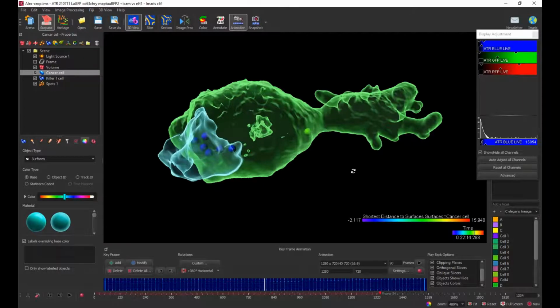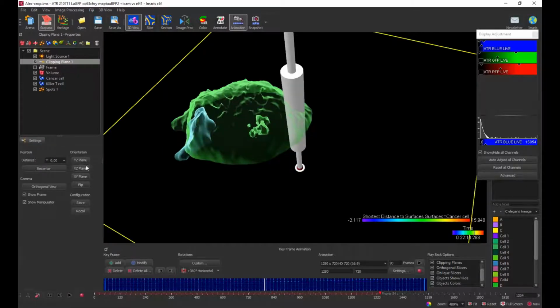Okay, and then the last question I've got for you from the list is from Julia, and she is asking what exactly is the clipping plane doing when it's uncovering the objects? Is it getting rid of the data? Can you talk a little bit about that?